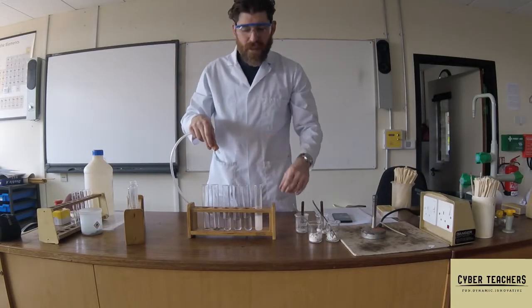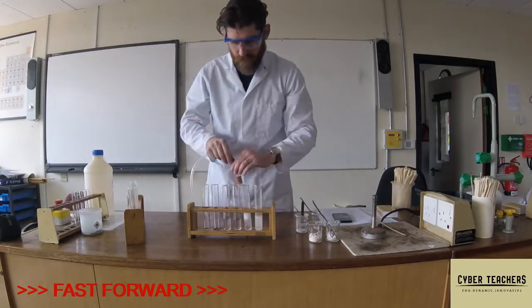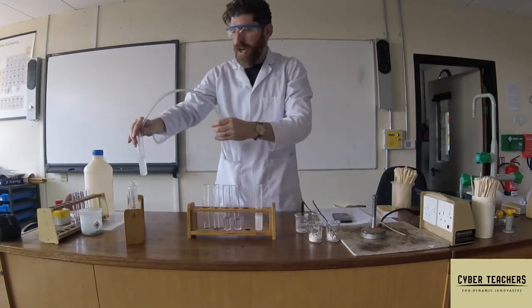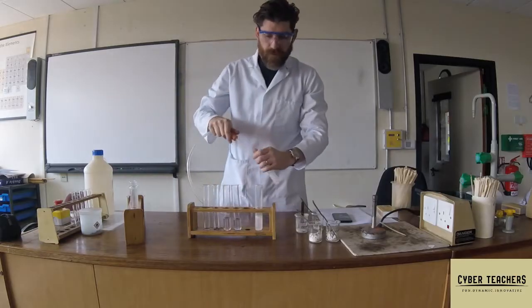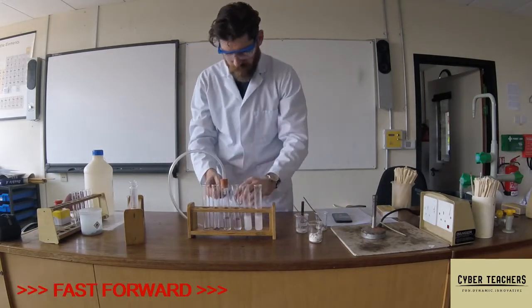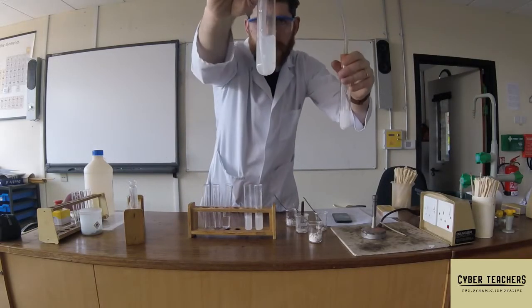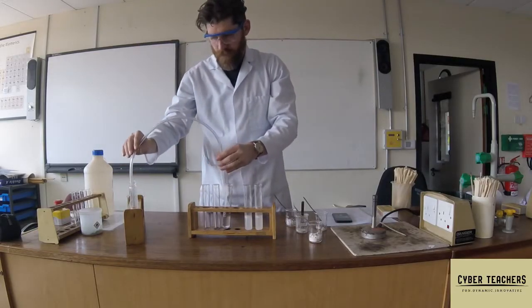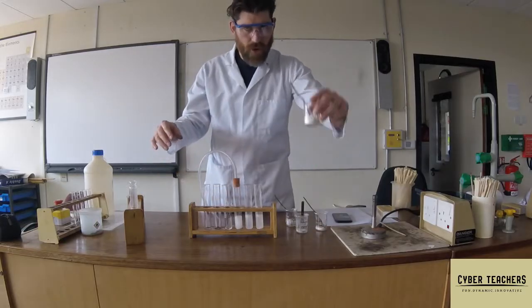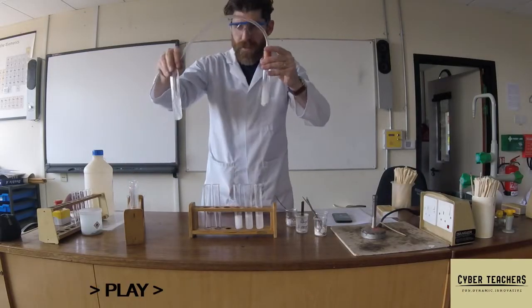I'll very quickly do the others and show you the lime water in each case. Next we're going to use baking powder - once again it's gone cloudy, so there's carbon dioxide there. Next one: marble - this is cloudy. And the last one, chalk - it's turned it quite cloudy straight away.